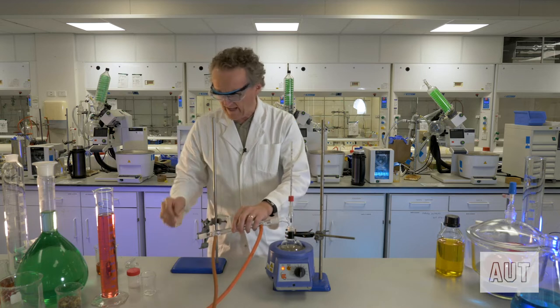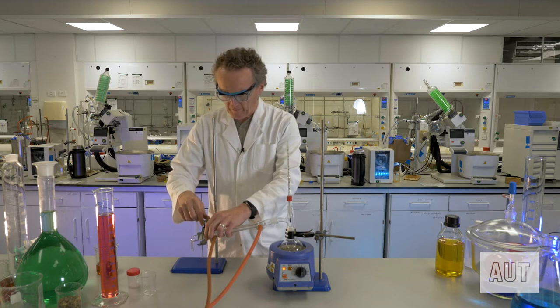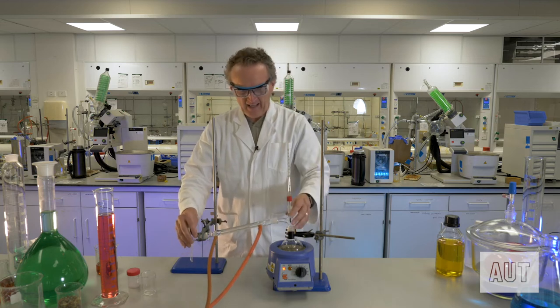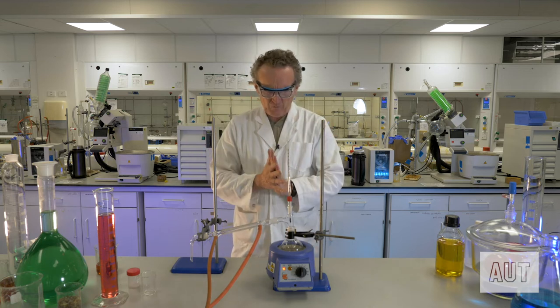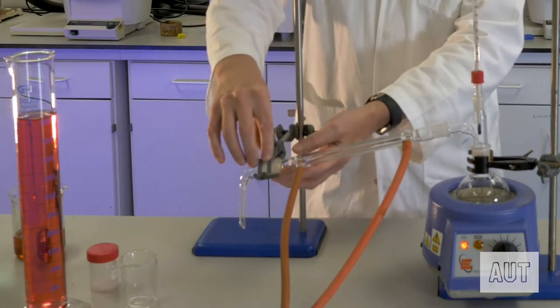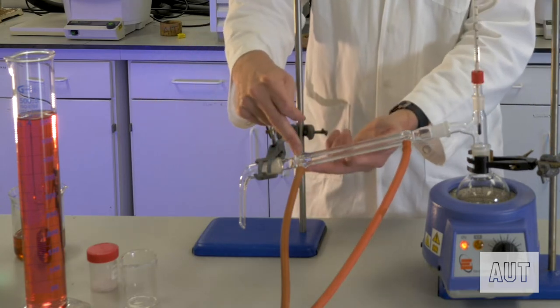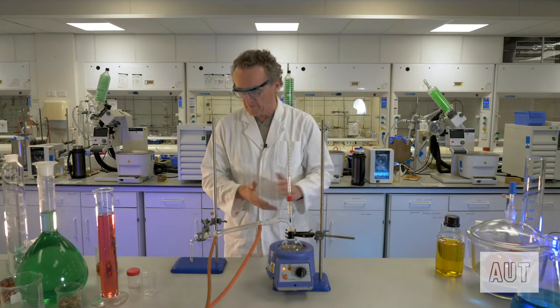Okay, we then put on our condenser like so, and our condenser is already attached to a tap. We've got our receiver adapter there, and it's really important that you clamp this in the correct place, because the receiver adapter will fall off if you don't have it clamped. Okay, so we're all pretty good there. Now, with the clamping, it's really easy to overclamp, to over tighten the clamps, and you end up crushing the joints, which isn't good, or else you clamp in the wrong place. For example, if you put the clamp there, that means that your receiver adapter isn't attached to anything. Gravity will eventually take hold, it'll fall off, it'll break.